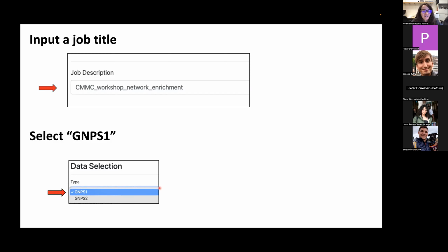So right now we are developing GNPS 2.0, in which we are remodeling how GNPS works, and the workflows that are present in GNPS 1, that is gnps.ucsd.edu, are going to be transferred to GNPS 2. So the idea is that it's going to be faster, more efficient. It's basically just a very, very big upgrade that is being made. But right now it's still in baby steps, as Peter mentioned. So right now we have the two websites that you can use. Yeah, there will be a transition.